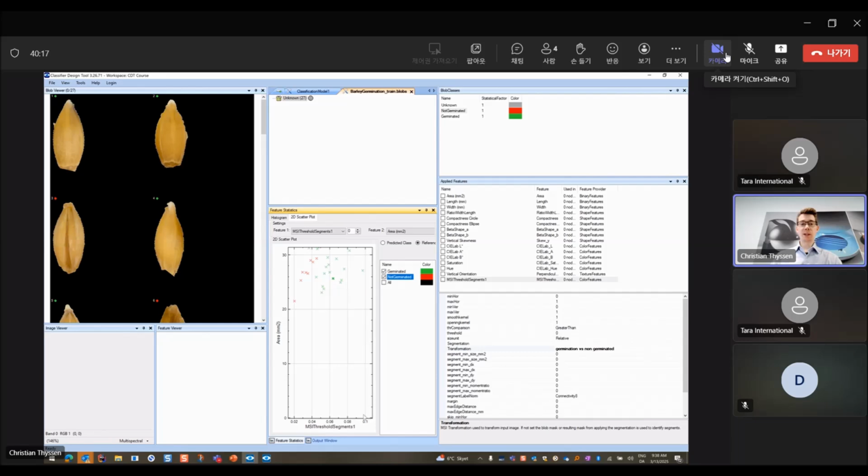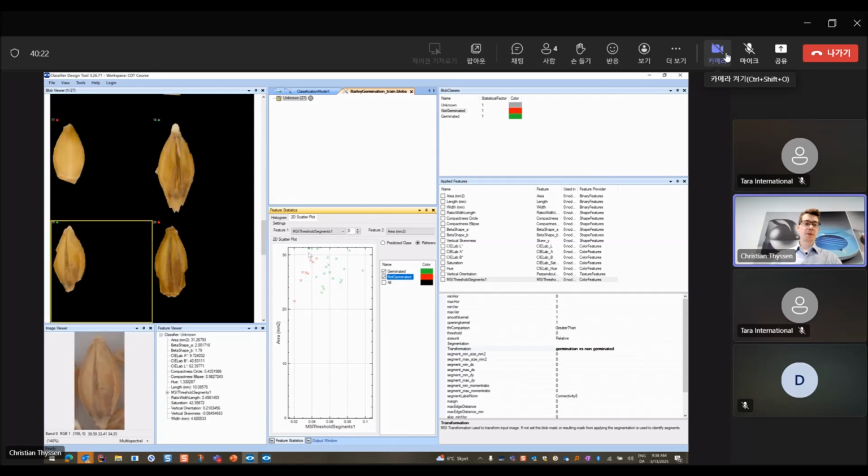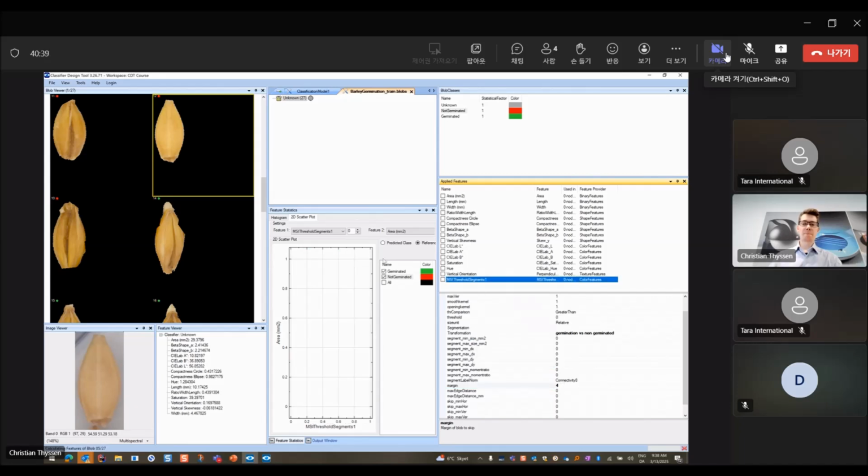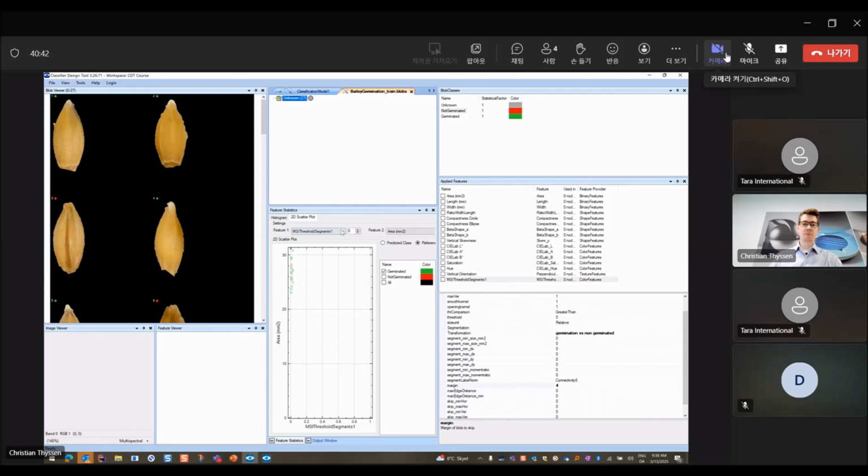And in this case, we actually get a very good separation, but we could improve it even more. In cases like this, we find a little signal, and here we find some signal maybe from the background. So we could increase the margin by a few pixels, and we see we get an even better result. So again, we could continue in this manner to get a perfect transformation, but this is the general idea, so we'll stop at this point.